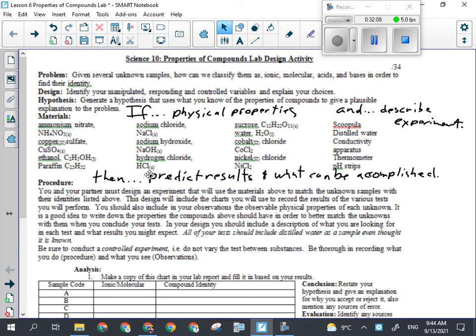And when you're telling them what to record, you just have to say record the number. That's on the face. That one's pretty easy. And then obviously rinse it between trials. Incidentally, please don't put this on your tongue. The light tells you the battery is working. These things have been in all kinds of really nasty stuff, and rinsing them with distilled water doesn't make that go away.